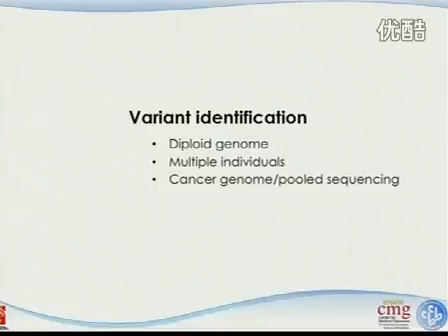So for variation identification, again, when people hand you their data, they say, "Oh, I already calculated the variants." Okay. Well, you want to step back a little and ask them, what did you do for this? What do you mean by variation identification? Then you want to think through whether the experiment you are doing really fits with the approach they are using. And the first one is for the diploid genome, and this is the most straightforward one.